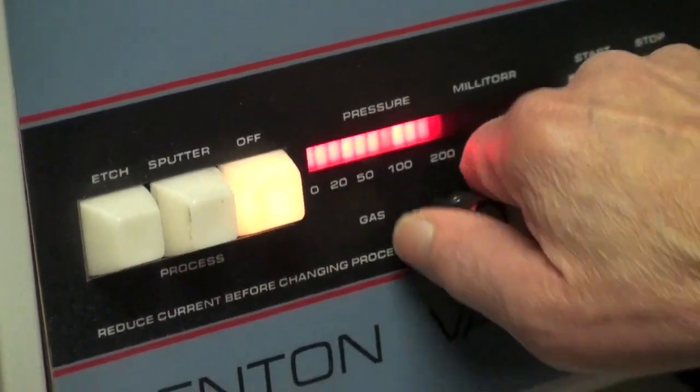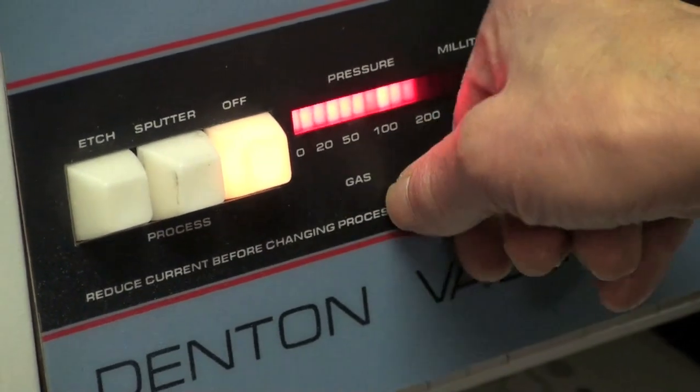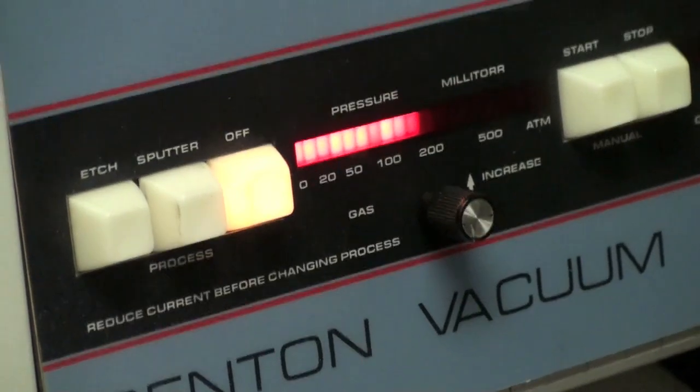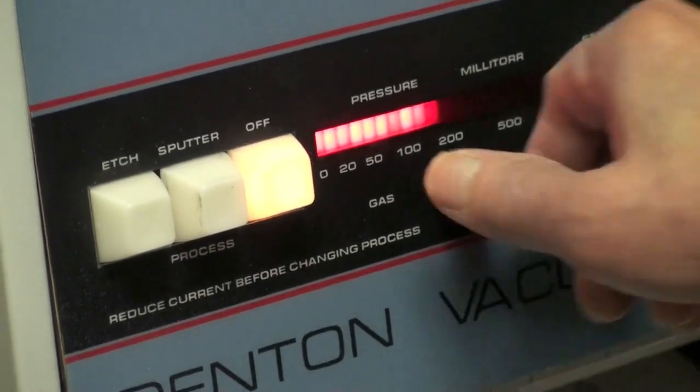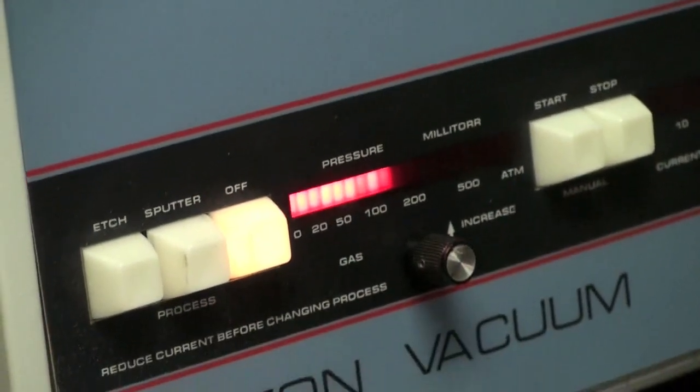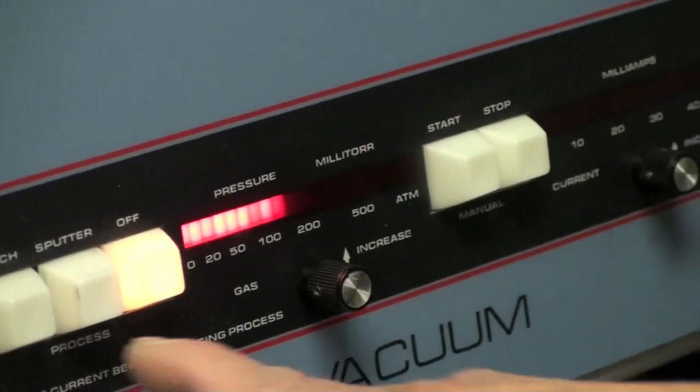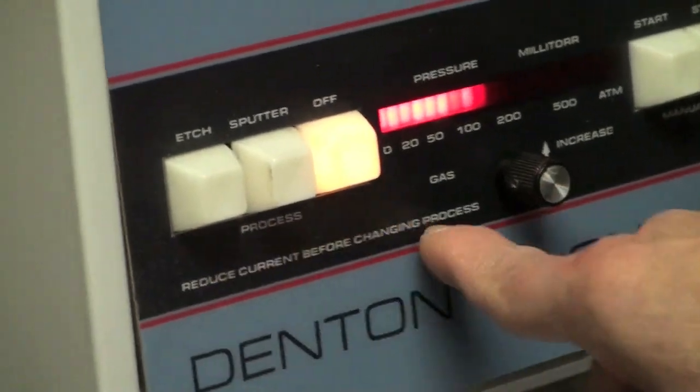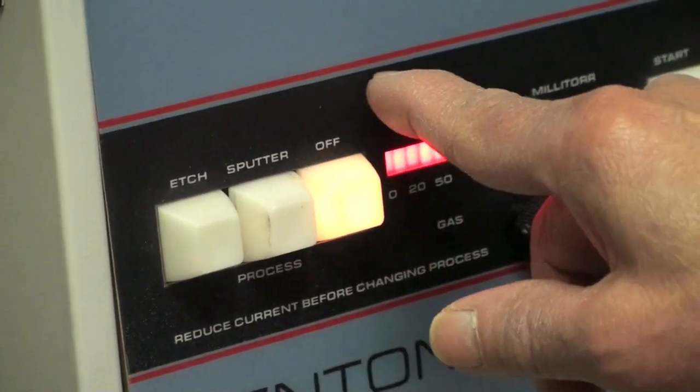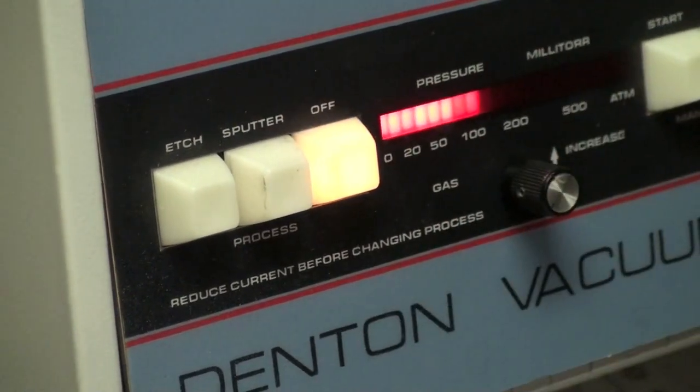This one is off, so it doesn't matter whether you open or close this one. If it's off. These three are solenoid valves. We will use only one, the sputter one and the off one. That's all.